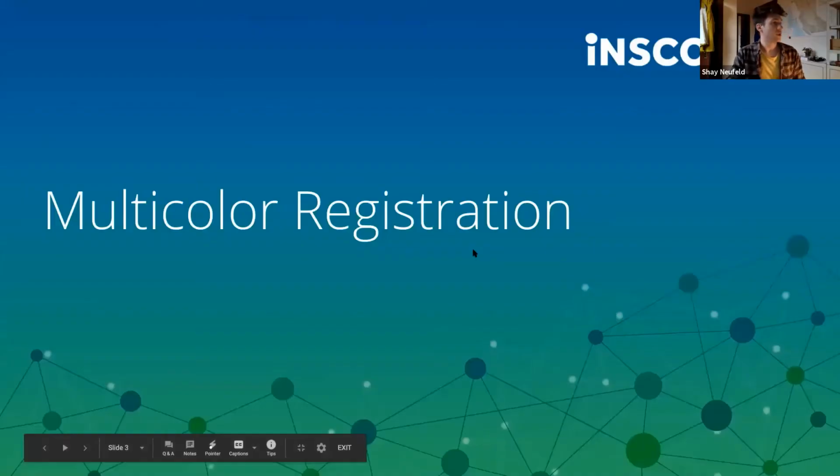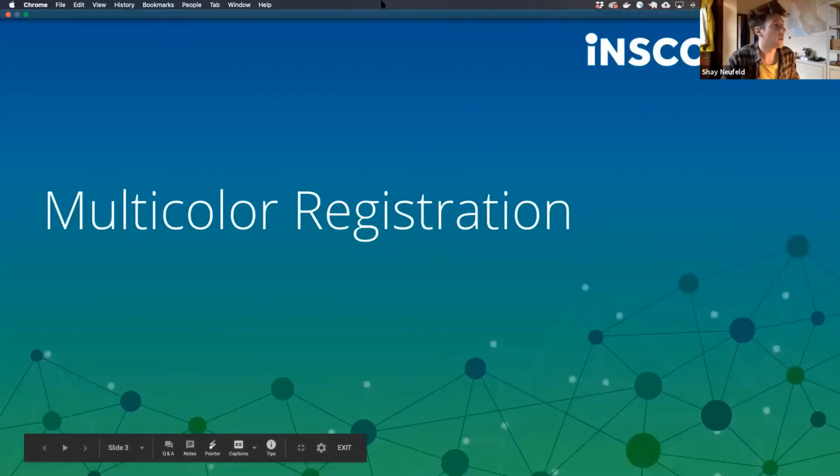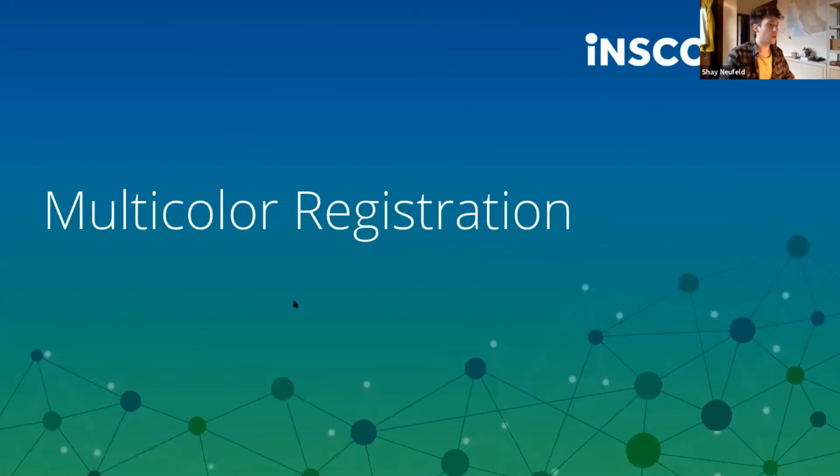Okay. So let's start with multicolor registration, and with that, I'm going to switch right over. There's not really any background here. I think obviously you guys know about nVue as the dual color scope. I imagine you've gotten separate training on IDAS about how to collect nVue data. Is that true, Shauna? Has that already happened? Awesome. Yeah, because that would have happened for the 1.5 release, right?